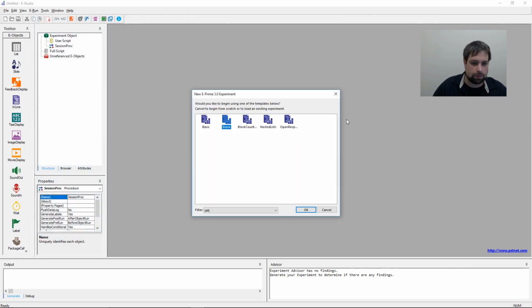So like I had mentioned before, we're going to be making an IAPS task. The IAPS task is going to show 2 image types. One of them is neutral images, and one of them is startling images. The startling images are going to be kept a secret from our participant, Cade, who's returned from our last webinar to help me out with Biopac again.